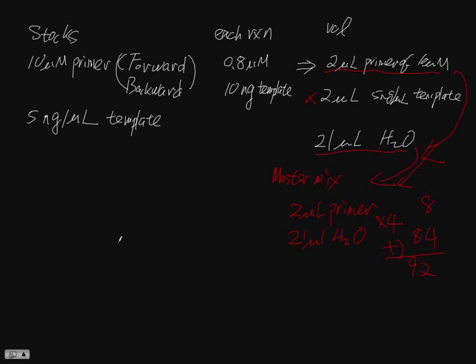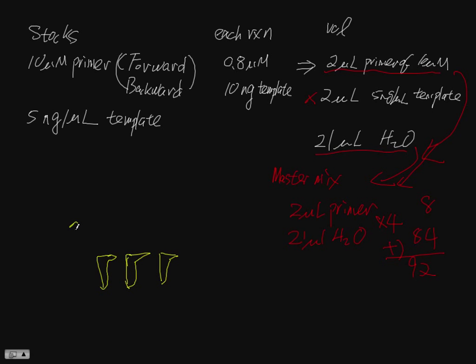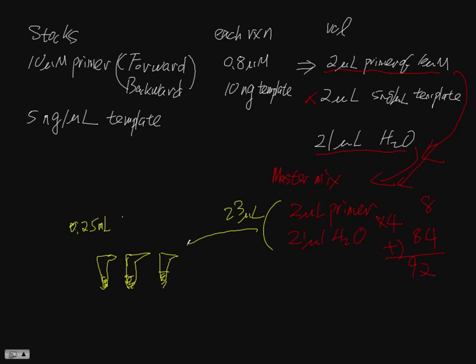Now we are going to set up PCR reaction. So you are going to be given 0.25 milliliter PCR tubes. And each tube, you are going to add this volume, which is 23 microliter to each tube here. That's from the master mix, you add 23.